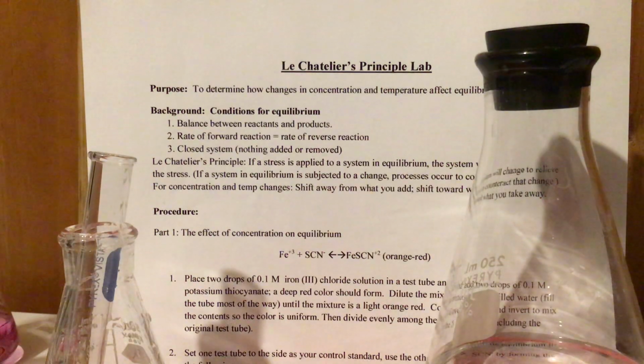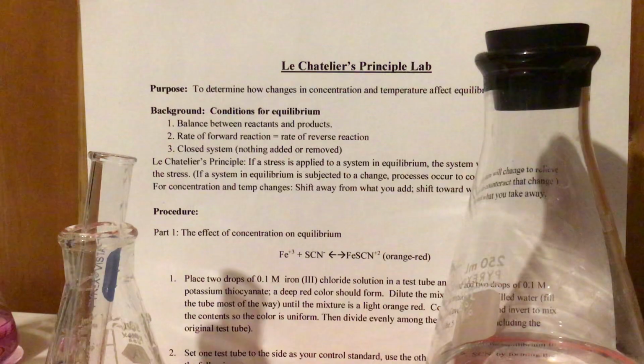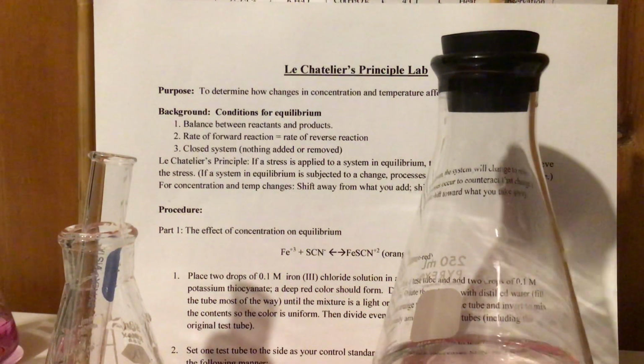We've got H2O liquid going to H2O gas, H2O gas going to H2O liquid. It's a little bit hard to see this flask right here, but that is what's going on at equal rates. We'll throw that in there right there.